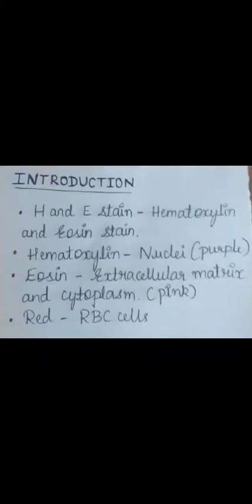Hello students, today we are going to study the science of Haematoxylin and Eosin staining. This technique is like a magic wand that helps us to unlock the secrets hidden within our own bodies. Haematoxylin and Eosin staining is a key technique in histology and pathology.